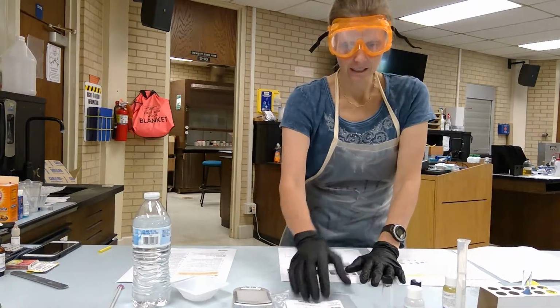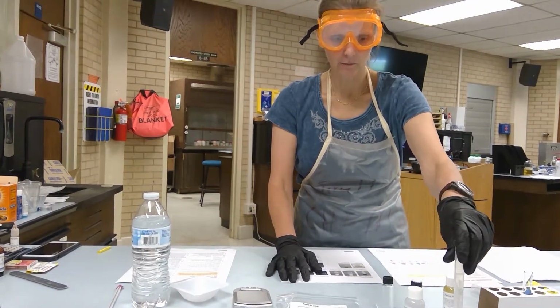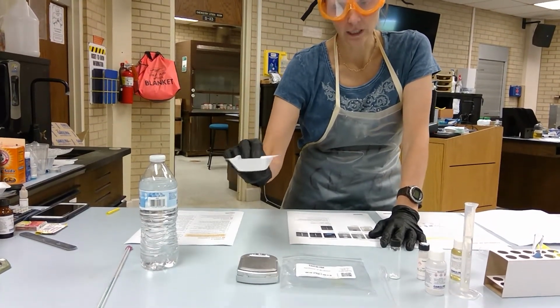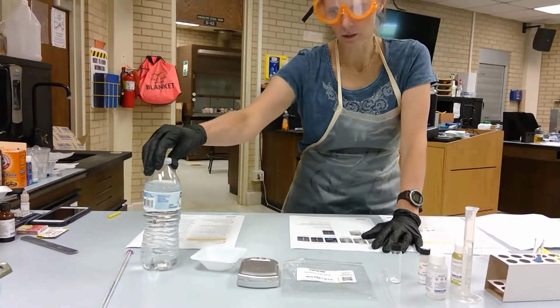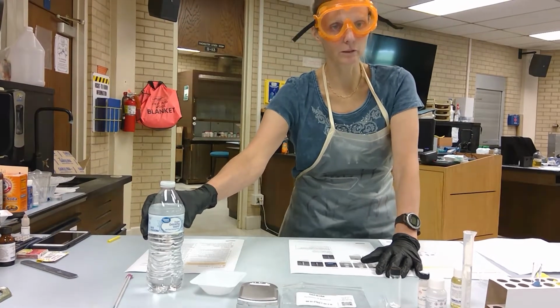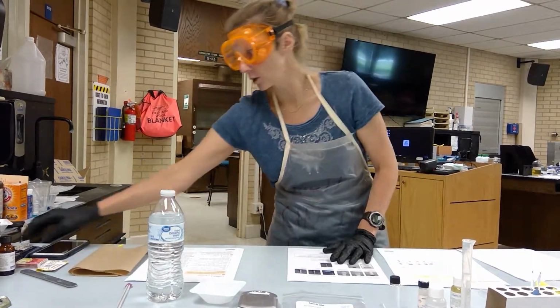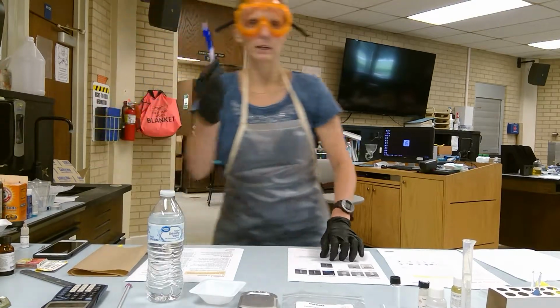Outside of that kit, in the general kit, you will be using a 10 mL graduated cylinder to measure out your methanol. You will also need your scale. You will need to pull out a weigh boat, even though your experiment does not tell you to do so. You will need to provide purified drinking water. Because this may cause a mess, you will have to have some paper towels on hand, and of course you will need your calculator and a writing utensil.